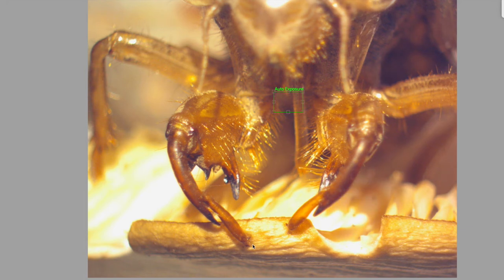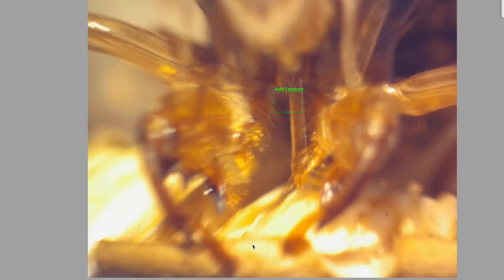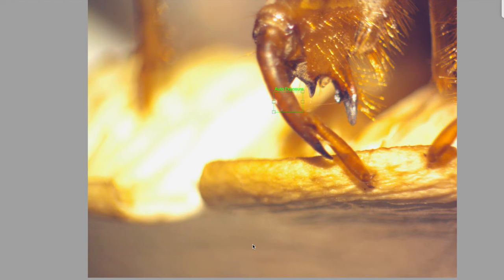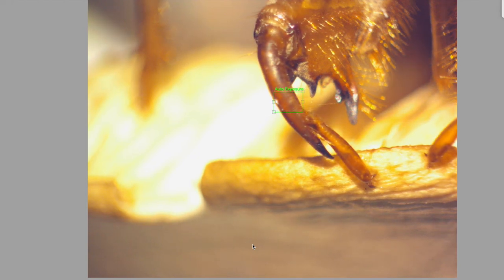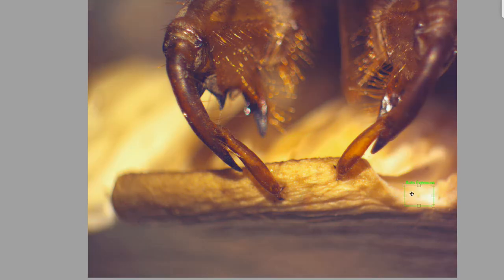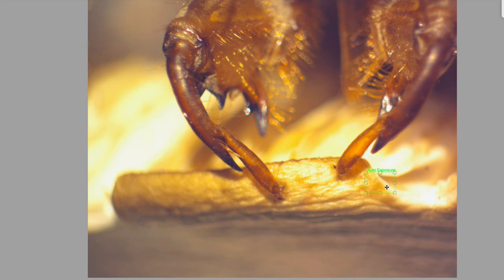Oh my gosh, there are little claws within claws. Oh, I'm so excited. Let's get to 10x. I hope you guys are all as geeky as I am. No, we don't want it quite that. Yeah, okay. So that's 10x. Go up to 20x.